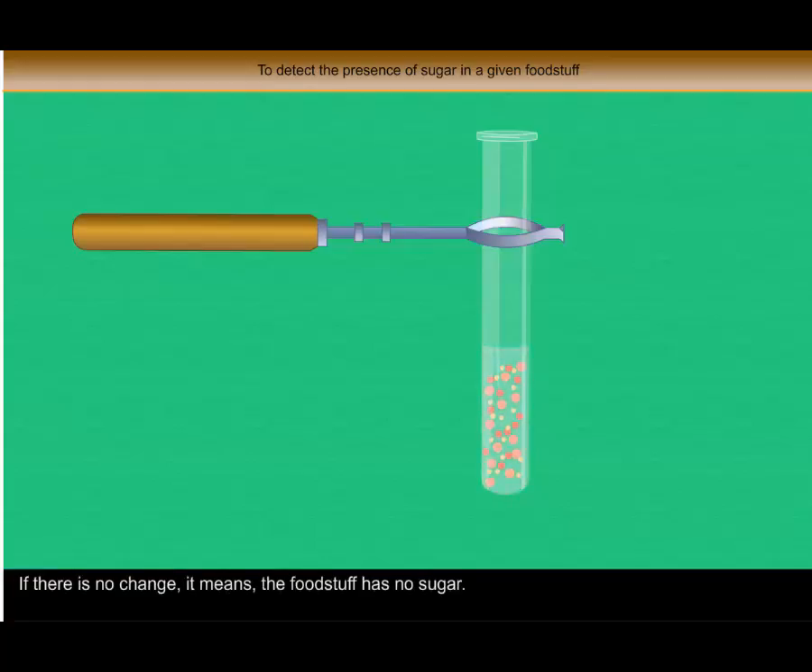If there is no change in colour, it means the foodstuff has no sugar.